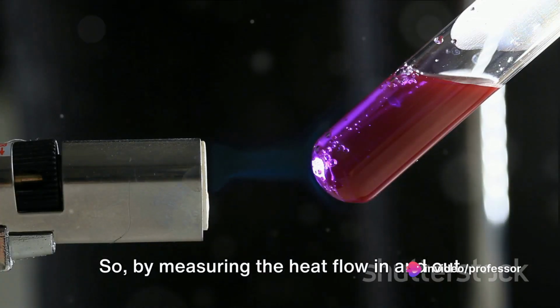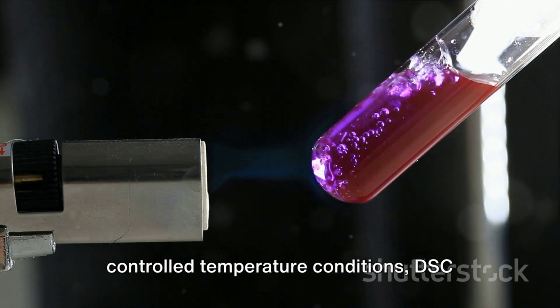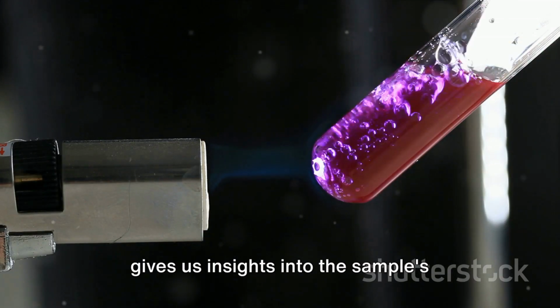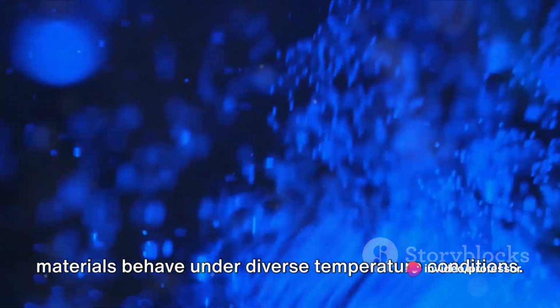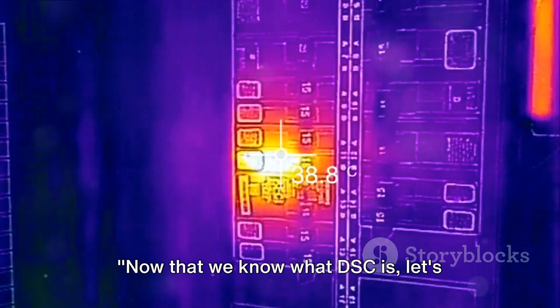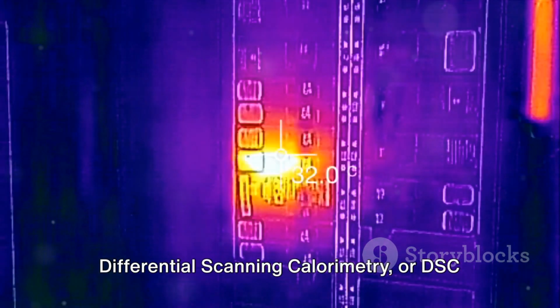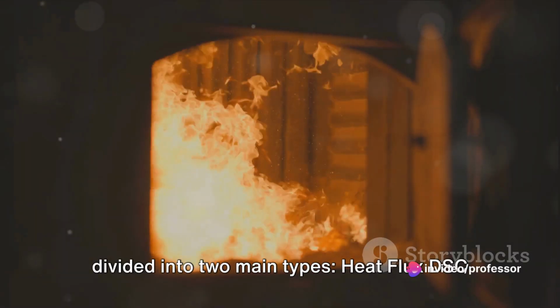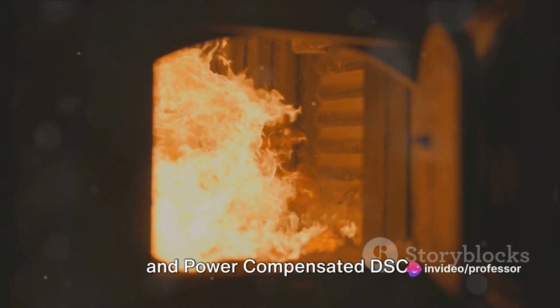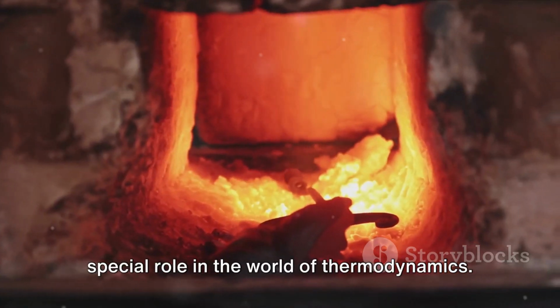So, by measuring the heat flow in and out of a sample compared to a reference under controlled temperature conditions, DSC gives us insights into the sample's thermal behavior. In other words, DSC is a detective that helps us understand how different materials behave under diverse temperature conditions. Now that we know what DSC is, let's explore its different types. Differential Scanning Calorimetry, or DSC as it's more commonly known, is primarily divided into two main types: heat flux DSC and power compensated DSC. Each type is unique, serving its own special role in the world of thermodynamics.